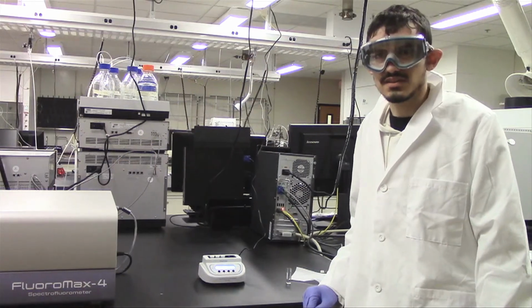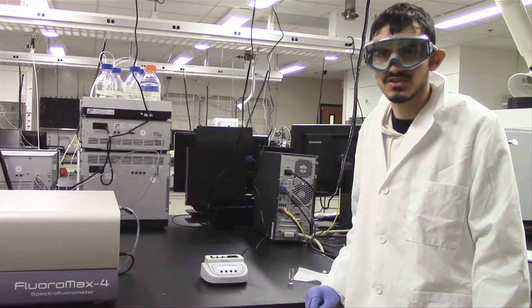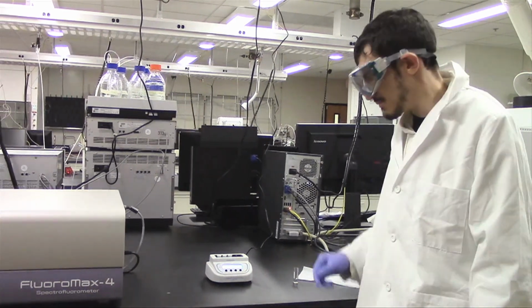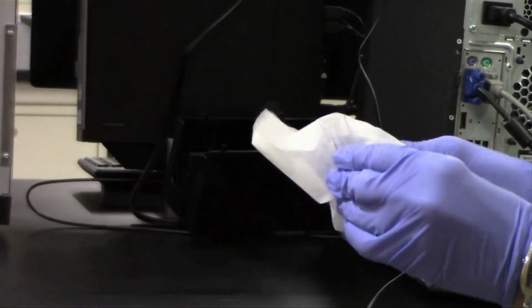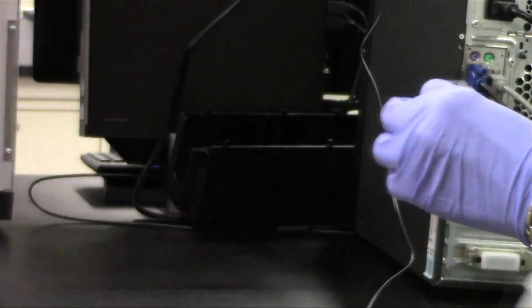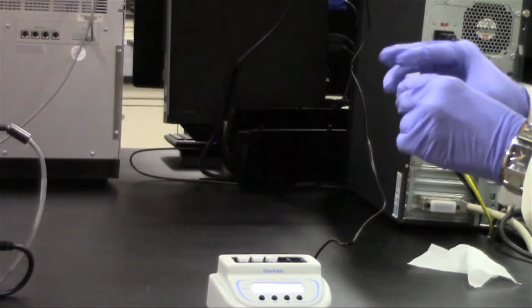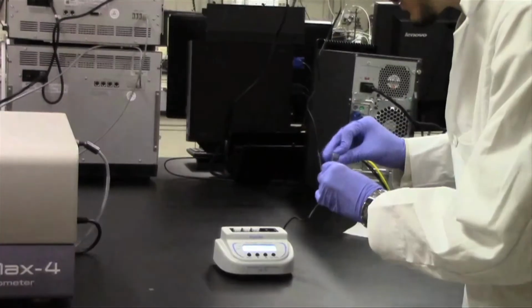So instead of using the sand bath to keep the cuvettes at a constant temperature, we're going to use a less messy method and use a dry block heater for the cuvettes, a thermostat. Before actually putting the cuvettes in this, you want to make sure that you wipe all the cuvettes off with a Chem wipe, and then make sure that they're capped so that you minimize evaporation of any of the solvent in there.